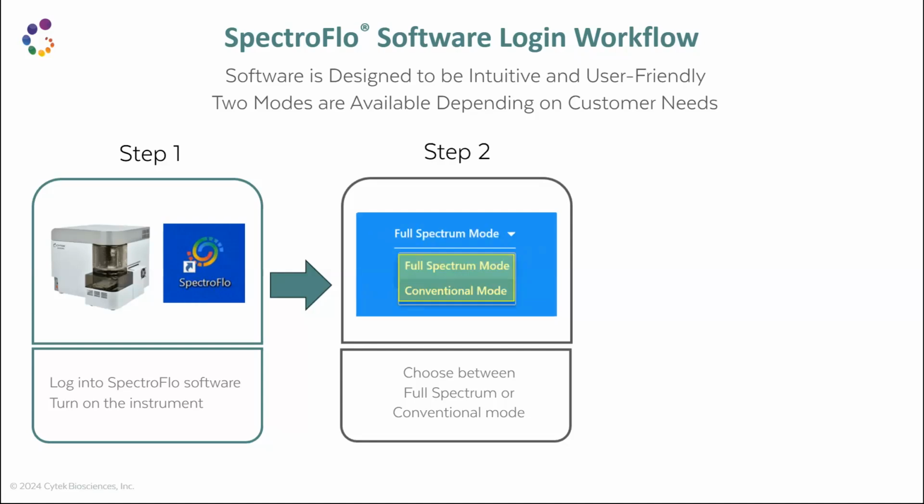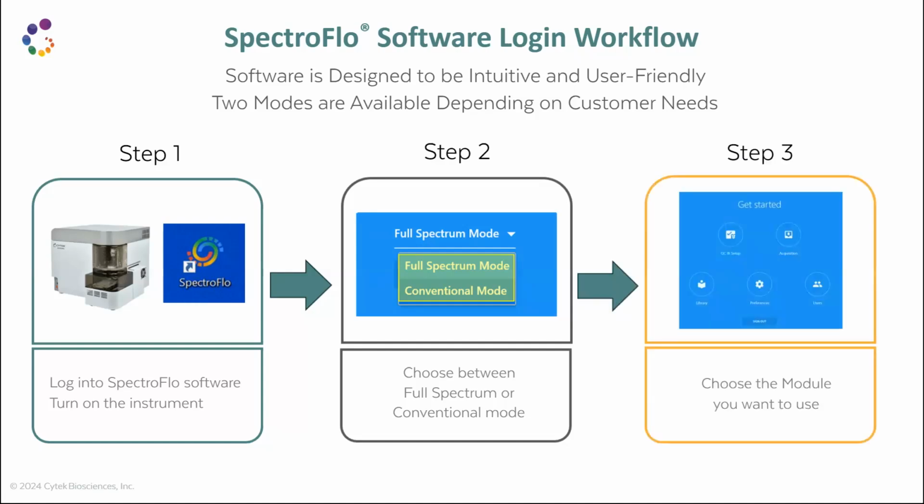Full spectrum mode and conventional mode. But once again, depending on your needs, you can proceed with either. And what you will see in terms of the modules available in the software is going to be different depending on the mode. Fewer options, basically, in the conventional mode.